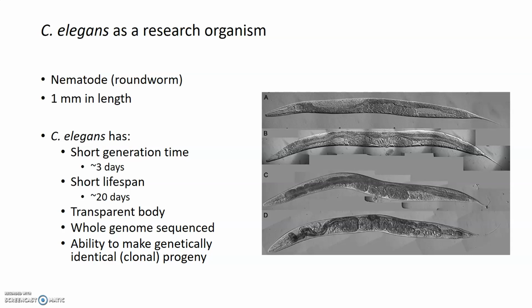There is what's known as an RNAi library, or a library of constructs that you can use to knock down expression of any gene in the worm that you want, and then basically see what happens. If you have a gene candidate that you might have identified in a human patient, and there's a homolog or a similar gene in the worm, you can use the RNAi to knock down that gene and see what happens in a living organism. So the power of C. elegans genetics is really strong and really helpful in research in general, but definitely helpful in aging research.